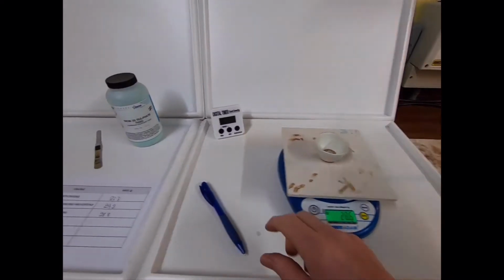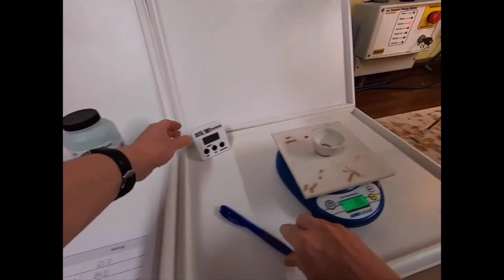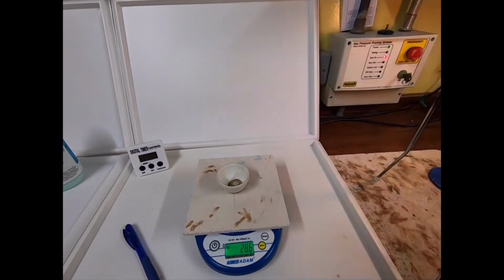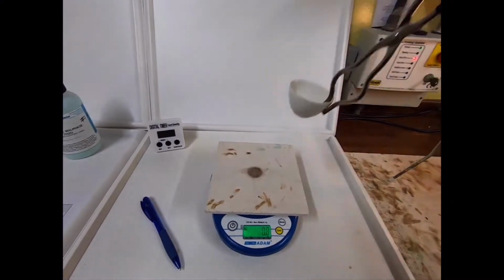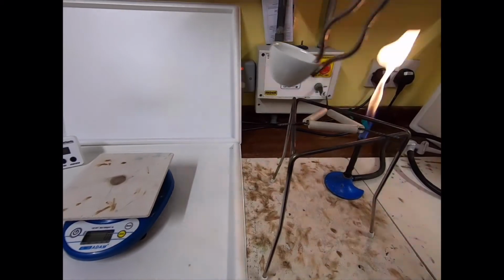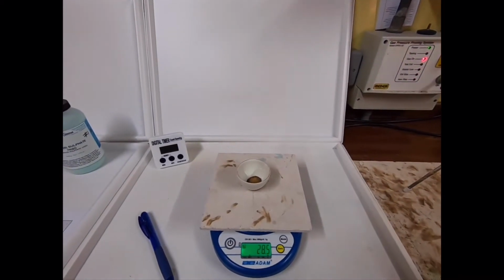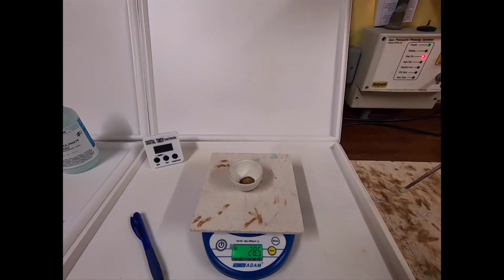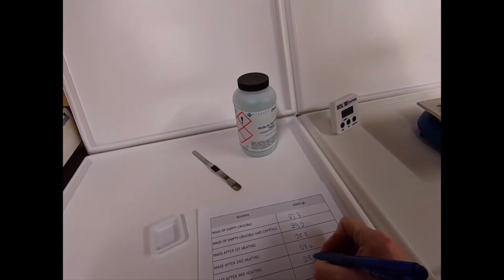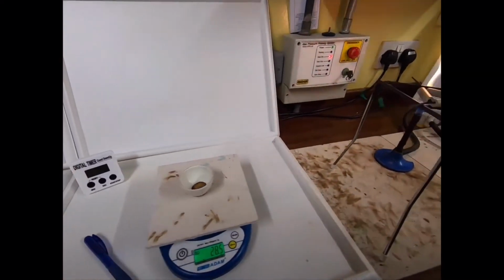So here we have the next mass measurement, which was 28.6. So again, the mass has gone down a bit. That means some more water has been lost. So we're going to have to do it again. And that's been heated for another 2 minutes, so we need to measure the mass again, and it's gone down to 28.5. So you would record that result in your table, and then you'll have to do it again because the mass has reduced a little bit.